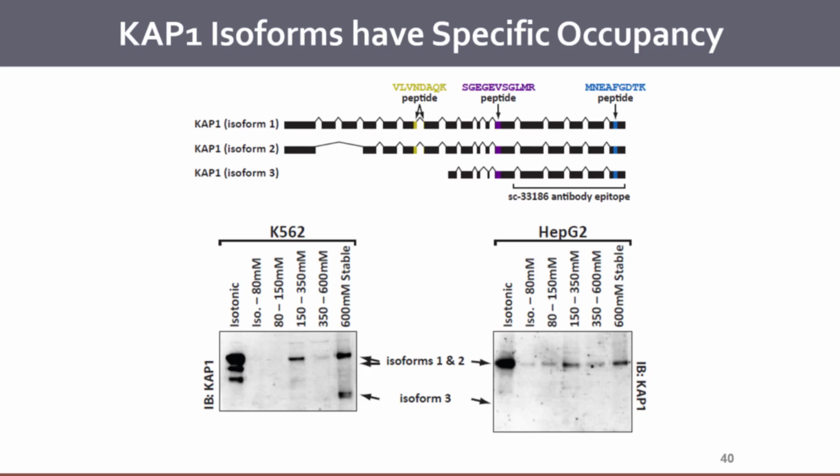The reason these babies were suffering from respiratory distress is because that portion of the protein wasn't being cleaved off correctly, and their antibodies weren't recognizing that form of the protein. So in general, I trust the data that we collect. The problem is, we just can't interpret it yet. But it's really kind of exciting whenever you go back and try to figure it out.